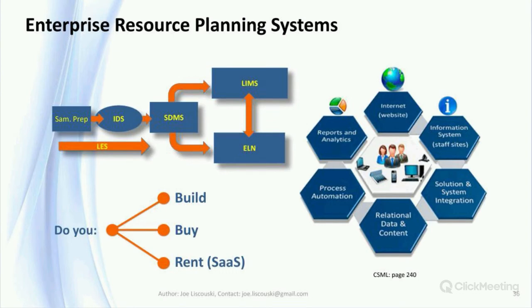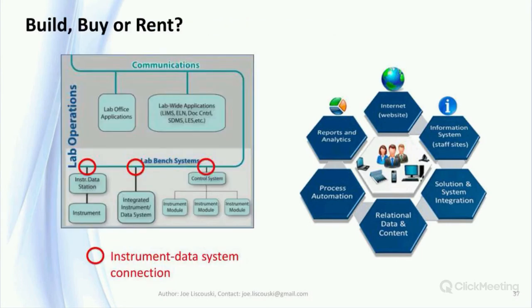So do you build, buy, or rent a solution? Using an ERP system as a base may seem attractive, as some facets of lab operations, particularly LIMS, are similar to other business practices. One aspect of lab informatics that separates itself from business practices is the need for connections to instrument data systems.